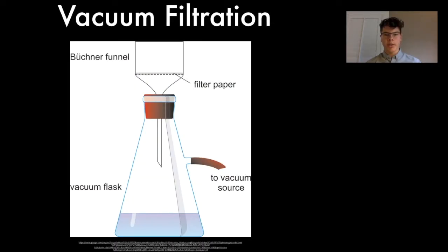In addition to this, there is also vacuum filtration. Similar to gravity filtration, where gravitational pull slowly splits liquid and solid apart, vacuum filtration utilizes suction and pressure to separate the two. Although similar in name, vacuum filtration requires different instruments than gravity filtration. A regular funnel is changed to a Buchner funnel, the flask is changed to a vacuum flask, and rubber tubing is used to connect the flask to create a vacuum within the container. The only two things that stay the same in effect are the filter papers and the precipitate solution.